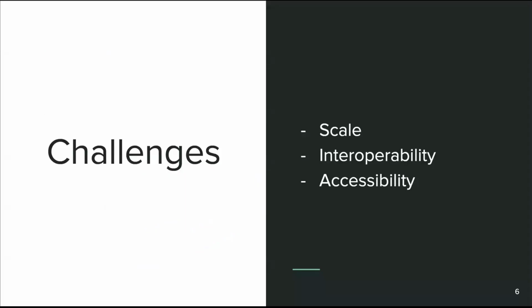Some of the challenges which mean that we need a next generation of file formats is simply the scale. Increasingly, we are in the age of big data, and the problem with big data is that it is big. It means that we are also in a more open science age, which means the ability to share data is even more important. It's not really possible to just post a USB stick with your experimental data or email a journal or anything else like that. We're talking gigabytes, terabytes, petabytes even for single data sets.